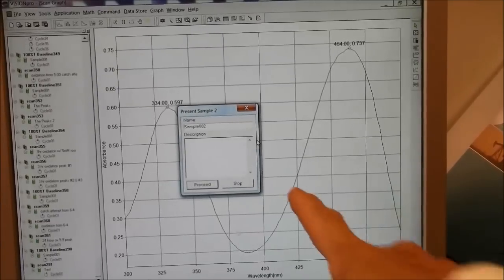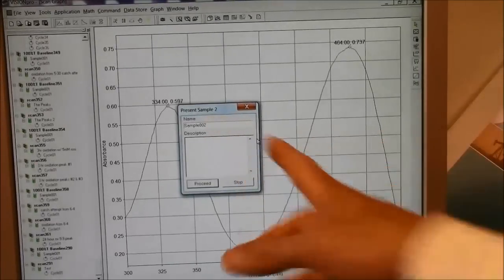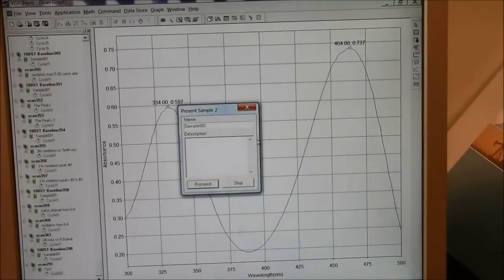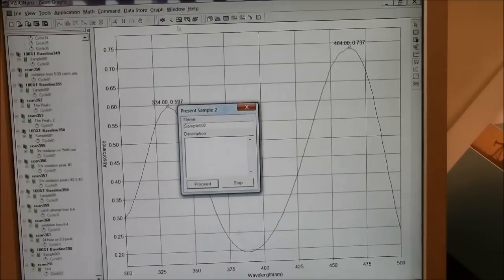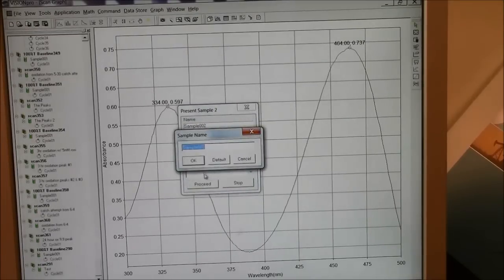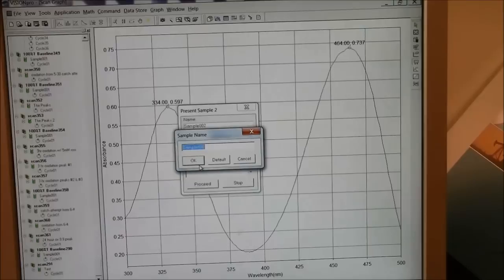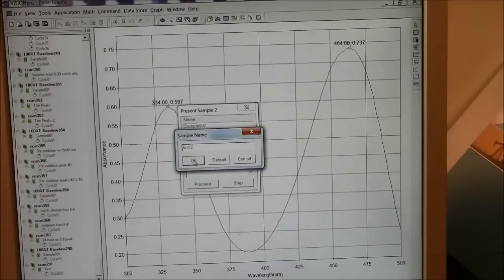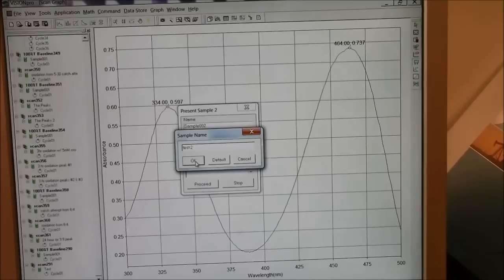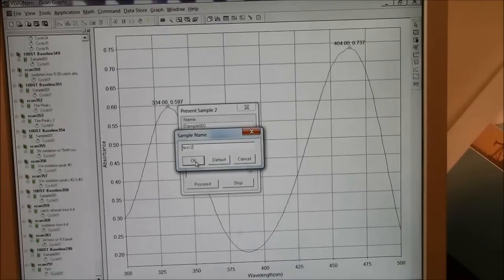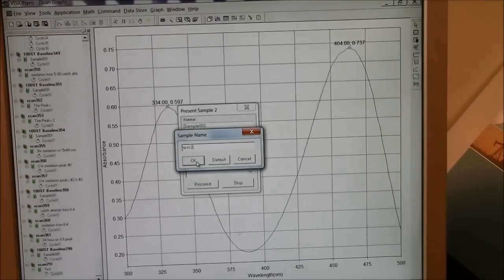It's now asking me to present sample number two. I don't have one. But if you are running multiple samples, then you would get to name this one. And you could call it test two, for example. Usually you want a much more descriptive name. What is the molecule in the cuvette? So that when you look at it a month from now, you'll know that was a spectrum of caffeine or a spectrum of aspirin.